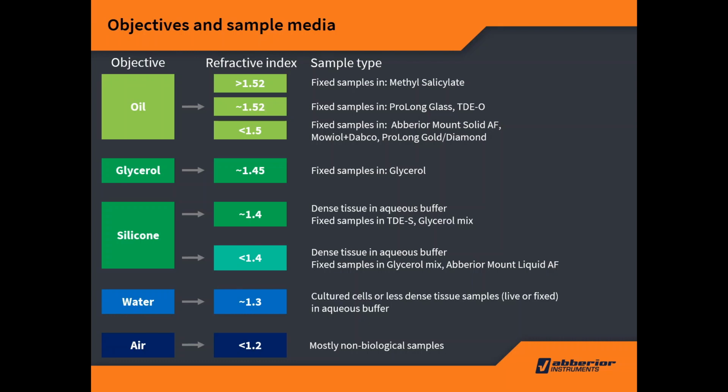Another factor here is that we were imaging in tissue, which is also increasing the refractive index above water. So both parts here contribute, but we were able to compensate that very well with the deformable mirror and got a good image quality at the bottom of the tissue slice.